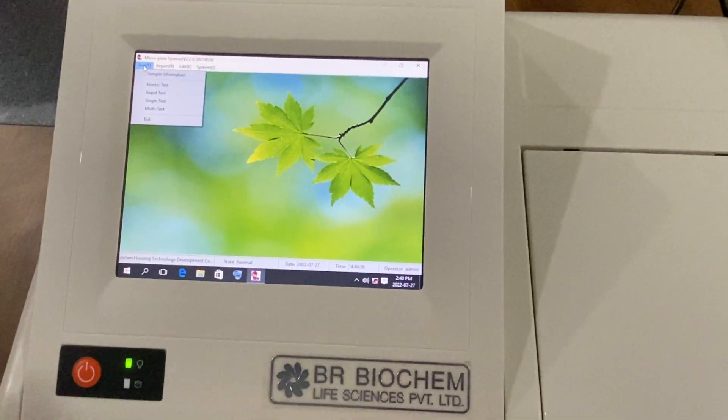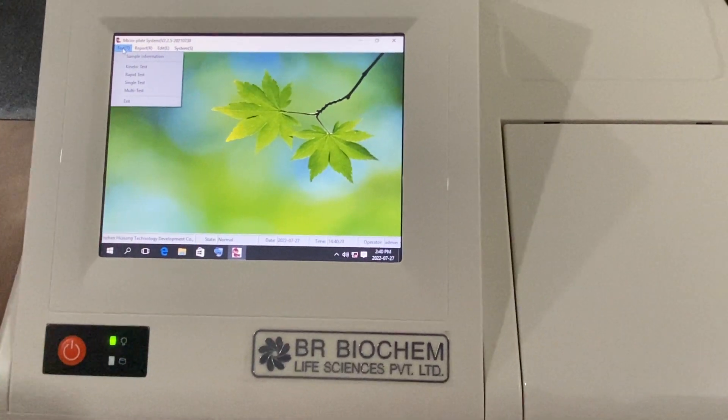With this ELISA reader, we also provide one keyboard and one mouse.